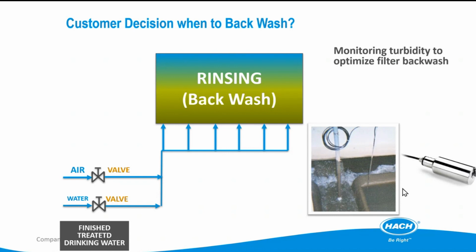If we do not have that, we use a timer. The water pump will run until the end of the backwash time. And sometimes this is not necessary because the water at that moment is already clean, but we still pump the water, so we will lose some water. Instead of that, we can install a Solitax at the backwash channel to monitor and to stop the backwash pump at the right time to save water. That is another application for drinking water treatment. Okay.